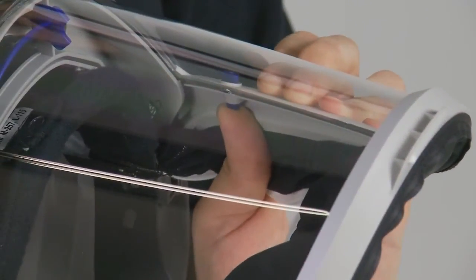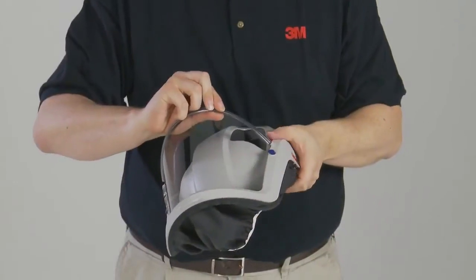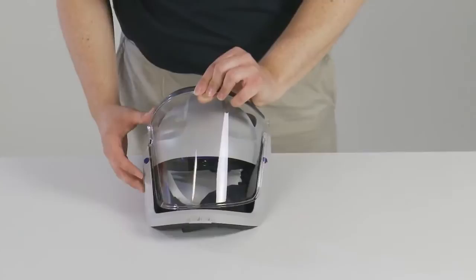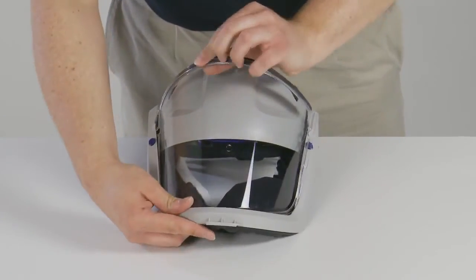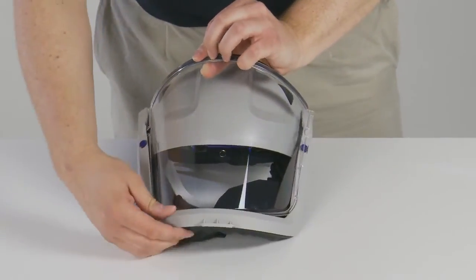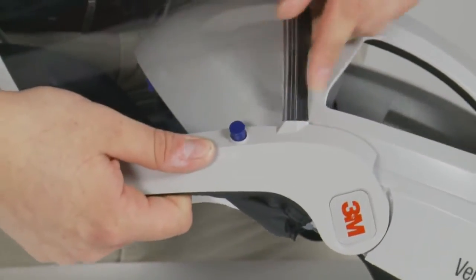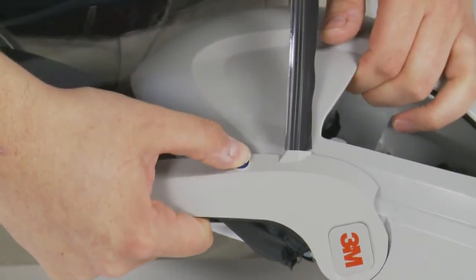To remove the visor, push out the visor frame buttons and remove the visor from the frame. To fit the replacement visor, align it with the bottom of the visor frame and insert it into the groove. Click the visor into place around the visor frame buttons and secure by pressing the visor buttons in fully.